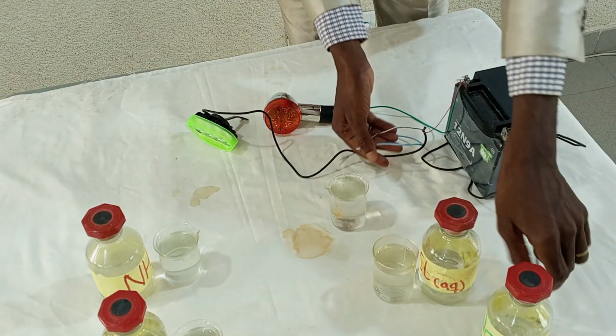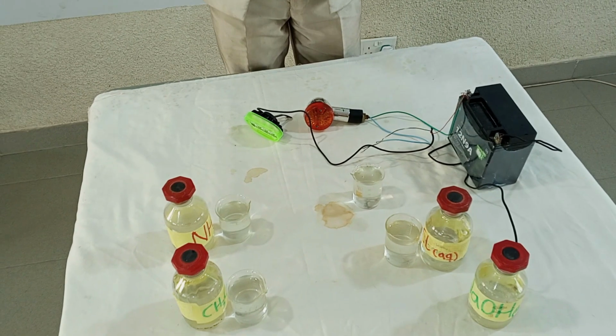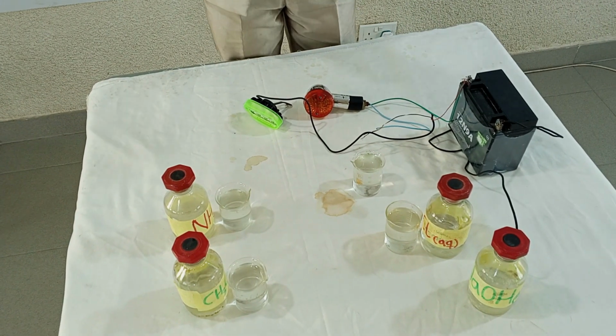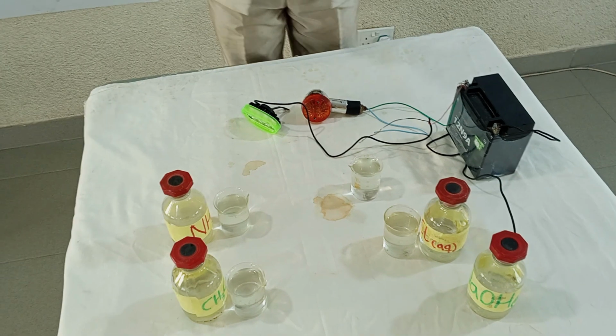So what does this tell us? Sodium hydroxide and HCl are a strong base and a strong acid. Strong acids and strong bases dissolve completely in aqueous solution, producing excess hydrogen ions and hydroxide ions. Therefore, they are able to conduct electricity. So they are strong electrolytes.